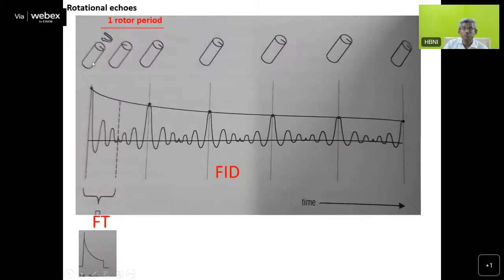See here, first the rotor I am showing here. The rotor is at this position. Now, the rotor has changed 180 degrees, 270 degrees, and again come back to the same position. Correct? Half a rotation is completed here, and one full rotation is completed here. So what must be happening when I am rotating like this? One half rotation and then one full rotation. Full rotation means I have started from here and I've gone through all these positions and come back to the same position.